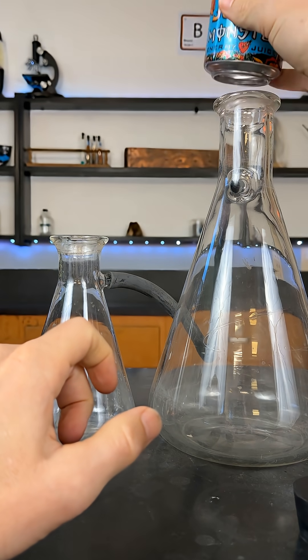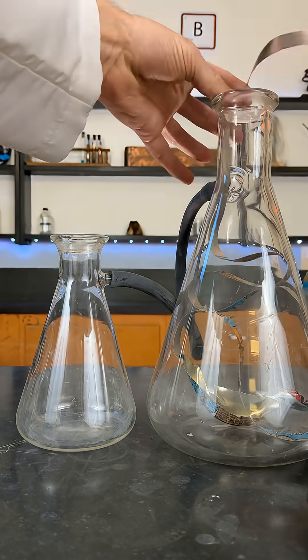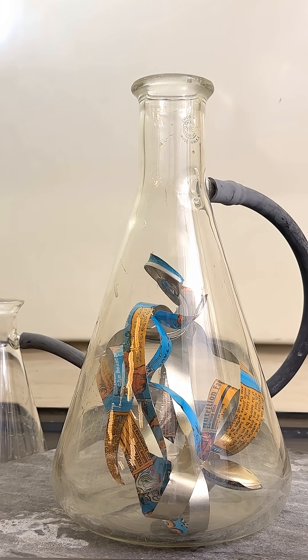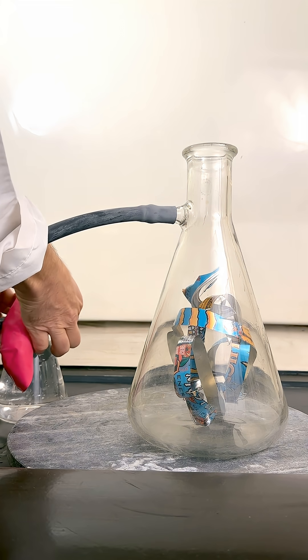I need to get the can in this big Büchner flask so it needs to be cut up. I then stuffed it in and made this cool pattern. For the next part I put it in the fume hood, added some water to the small Büchner flask and put on the balloon.